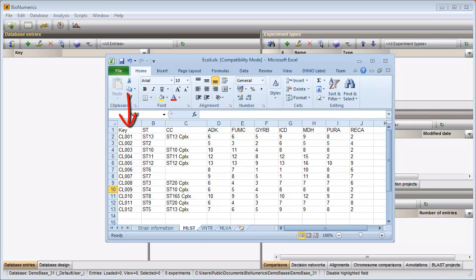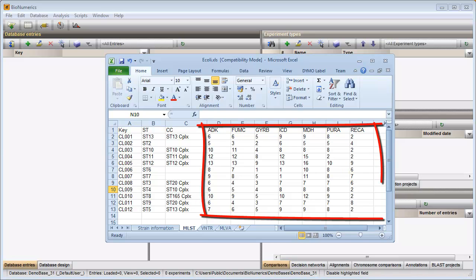A unique identifier, an MLST sequence type and a clonal complex number. Finally, the allele number for each of the seven housekeeping genes is reported in the last columns.